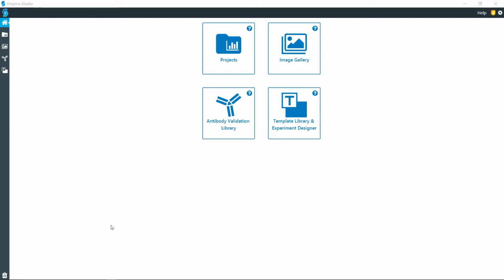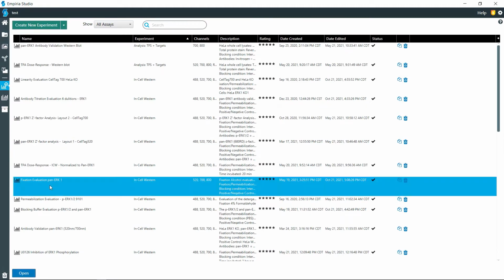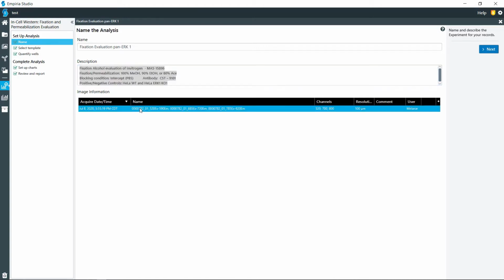In this video, we'll be going through the steps involved with evaluating fixation and permeabilization for the In-Cell Western. So I'm going to open up a project here, and I'm going to open an experiment that has already been started. But just as with all other analyses in Empiria, at the beginning here, you give the analysis a name. You put in whatever kind of description that you would like up here, and then import the images from your acquisition.